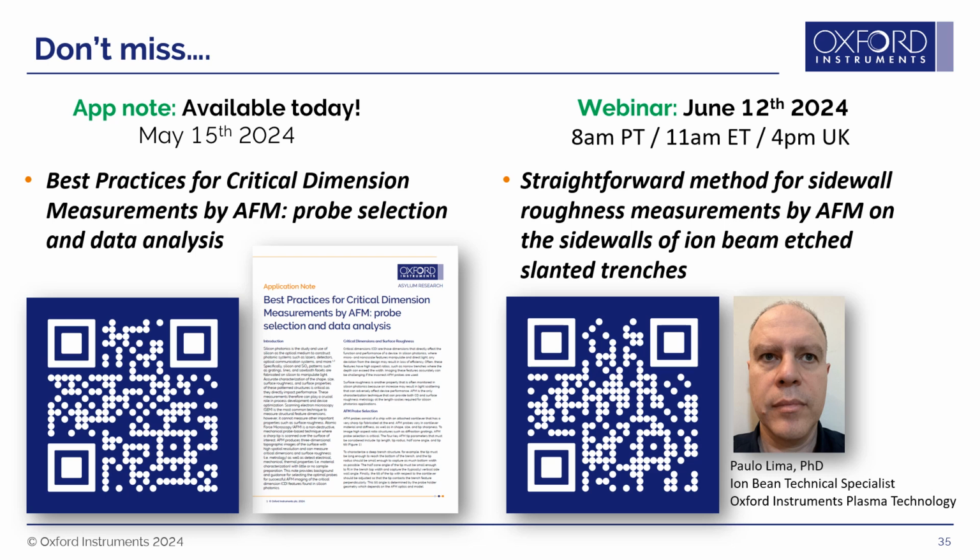Okay. Marty, you also mentioned that there's a chance of tips getting dirty. Is it possible to clean the tips? Yes, it's not necessarily easy, but there are ways to try and regain some cleanliness of your tips. You can try placing your probes in a plasma cleaner, for example, or under UV light for some period of time, and hope that whatever contamination, if it's organic, will be burned off or oxidized.